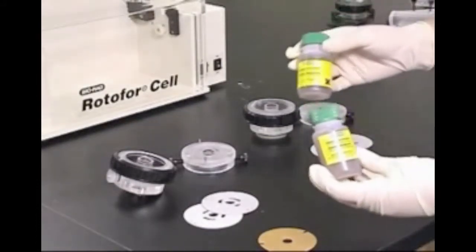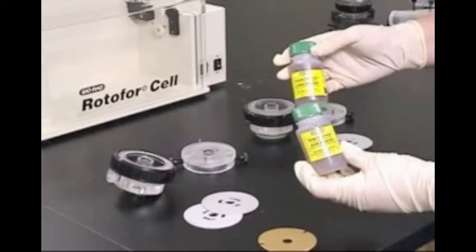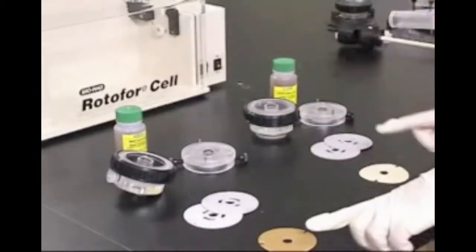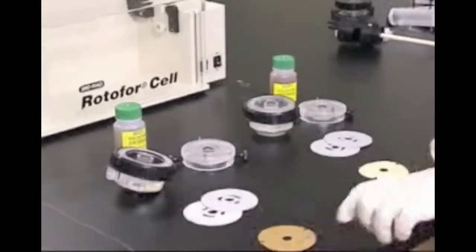Prior to use, the ion exchange membranes must be fully equilibrated overnight in the appropriate electrolyte solution. In the Rotofor Starter Kit, the membranes are pre-equilibrated and we will use these in this assembly.